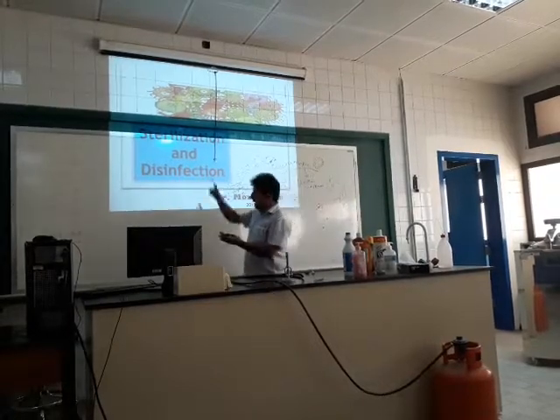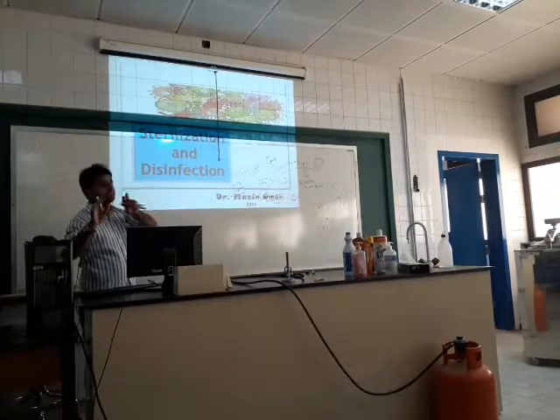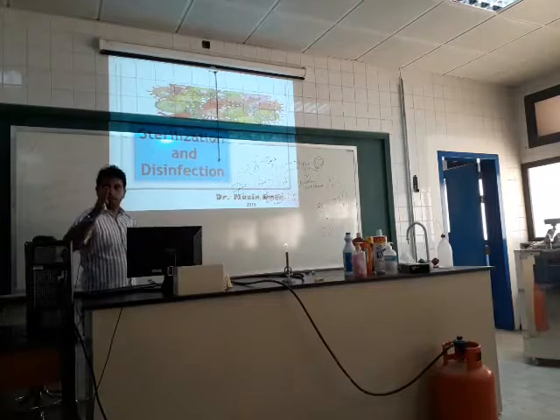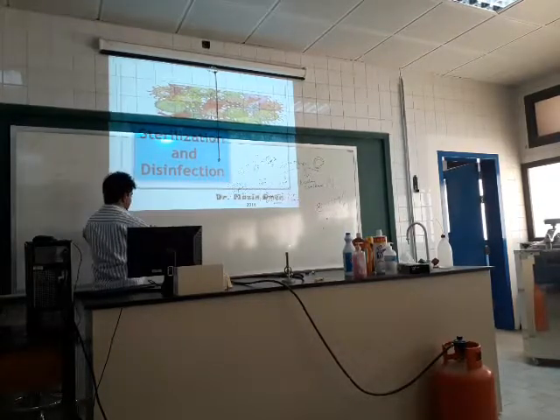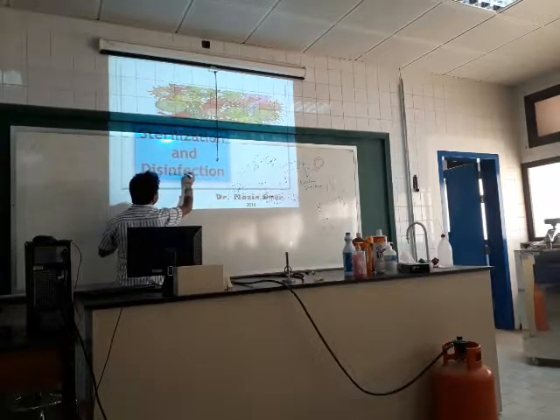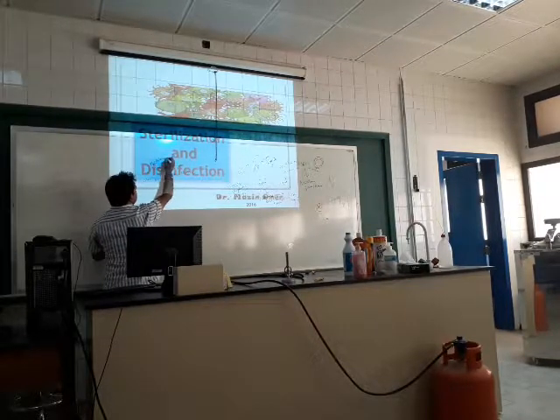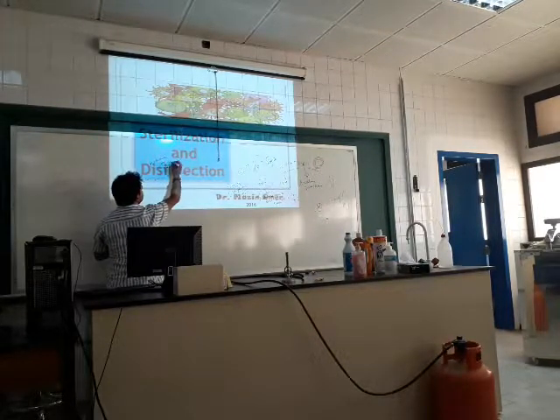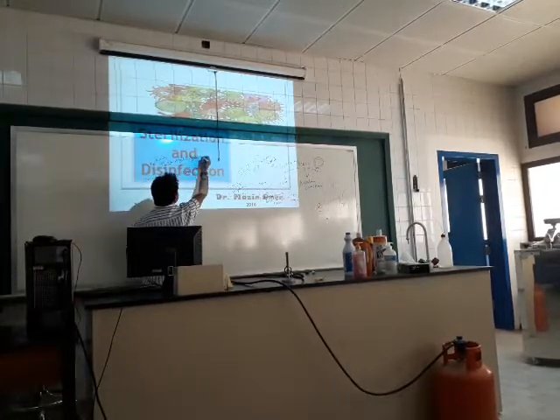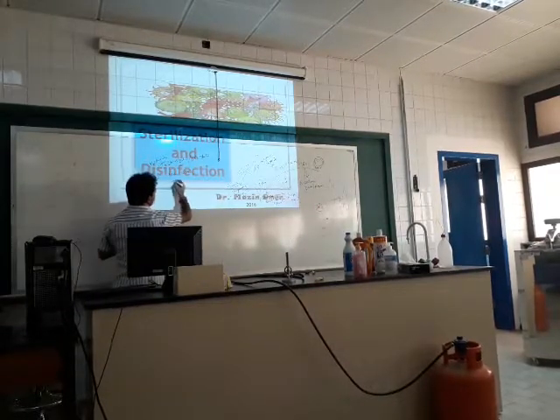So we use various approaches to get rid of microorganisms from the living as well as from the non-living. What is non-living? We use various methods for sterilization or disinfection to remove microbes from living tissues and from the non-living.